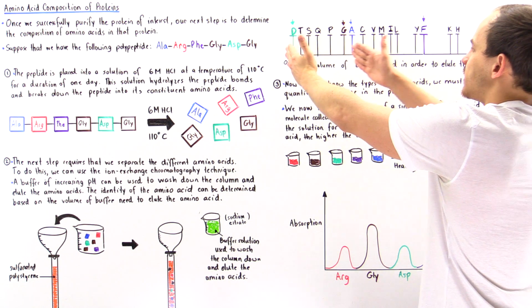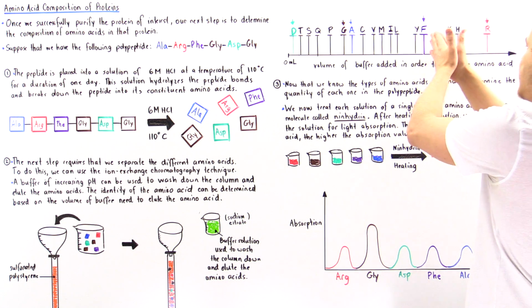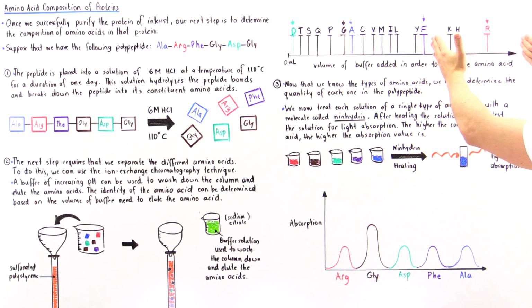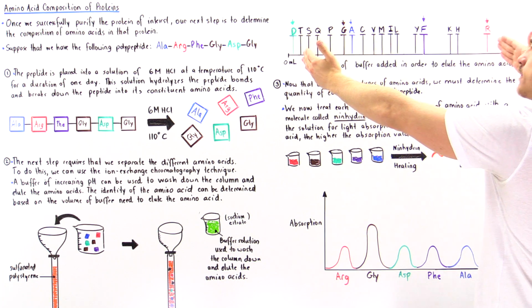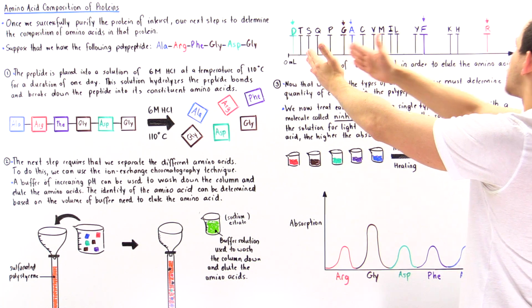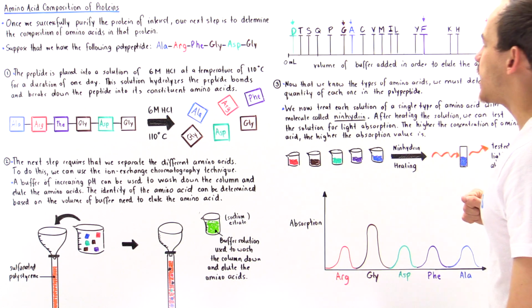So in this area, we have a very acidic buffer that we use. In this area, it's not as acidic. So as we go this way, the acidity of our buffer basically decreases. It becomes more basic. At the same time, the volume increases going in that direction.